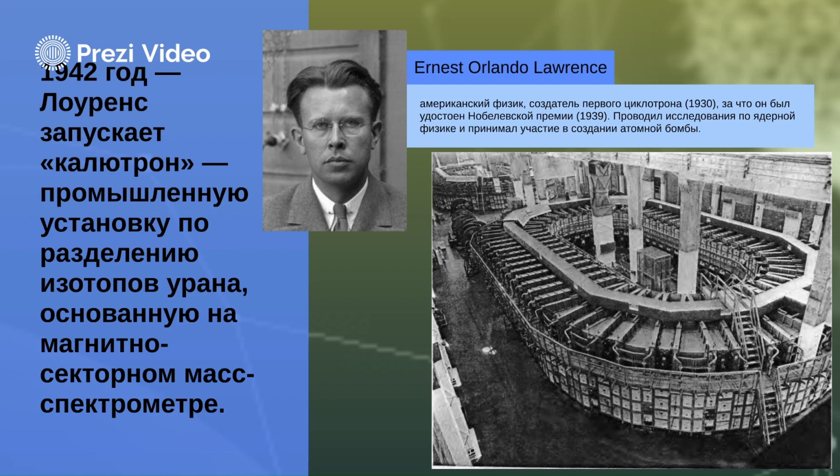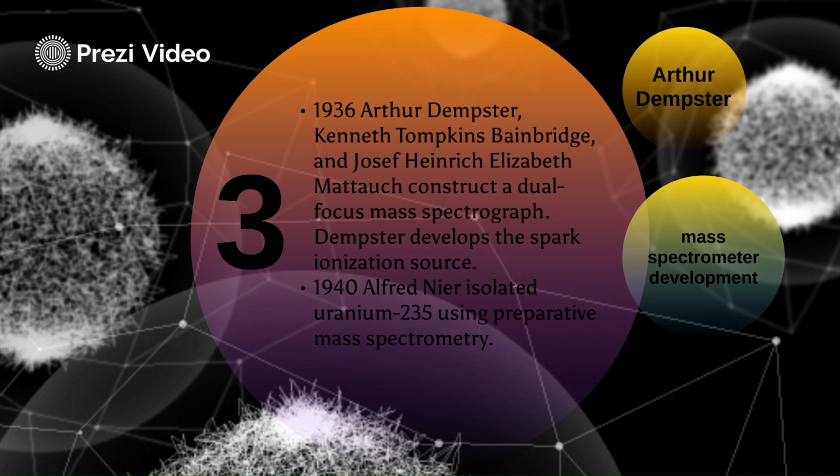For the first time, a mass spectrograph was used to determine atomic masses by F. G. Aston, 1919. In 1928 to 1939, Aston improved his instrument. Atomic masses were determined by him with an accuracy of thousandths of a percent.